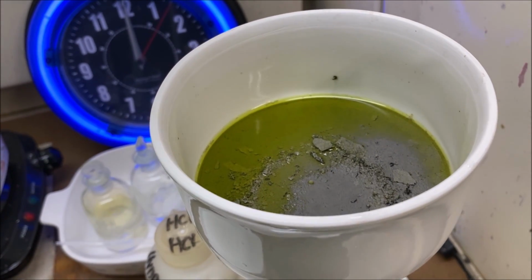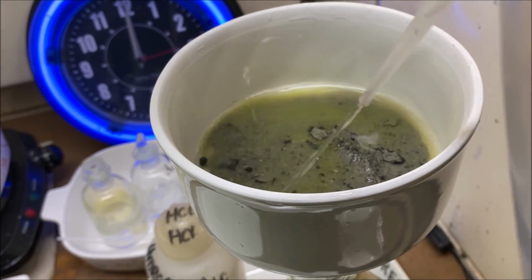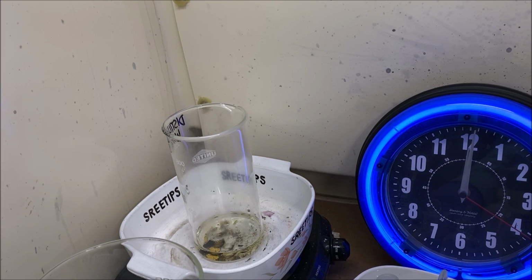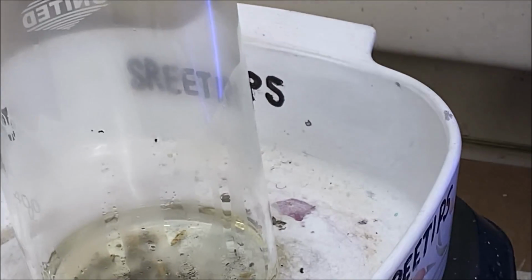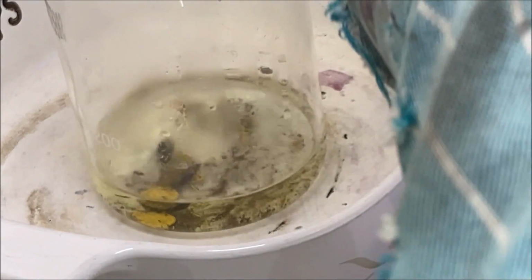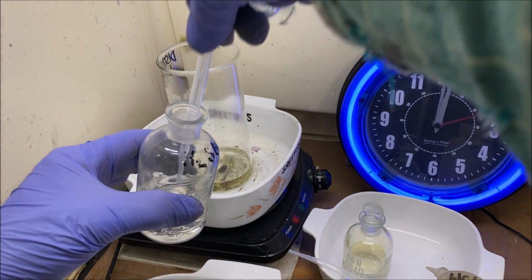Alright, our filtering is almost complete up here. Now what I'll do is I'm going to put some nitric acid. Let me get this thing out of the way. I'm going to put some nitric acid in this beaker down here. And I think what we're going to try to do is try to dissolve these little pieces down here separately. Here we go, nitric acid going in. A few drops of sulfuric, take care of any lead that may be present.